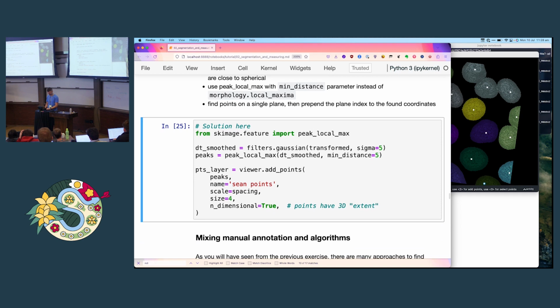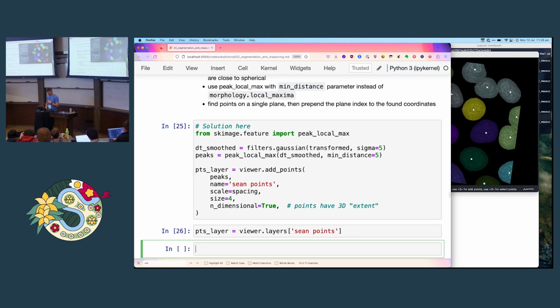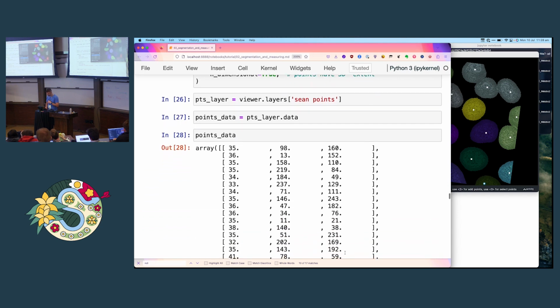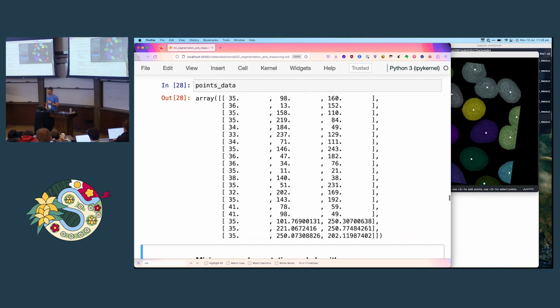Okay, so now I'm going to do that. And that is our final segmentation. You can see that the nuclei that were together before are now separated. This should be two things, but it is one thing, so I suspect that, despite my dilation, one of those seeds never got outside of its own little lake. We can go back to 2D to have a look here. You can see it. See how one of the labels is stuck into its little environment. So again, this is something that you could do with painting.